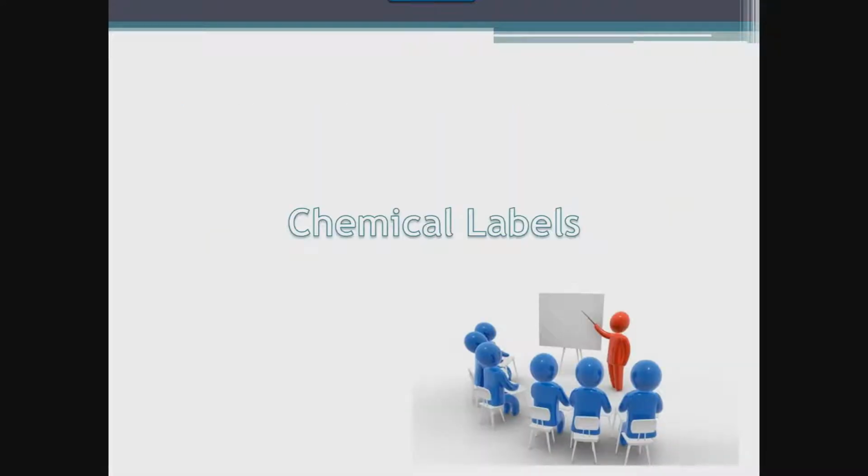So while safety data sheets are a great resource, it is important to understand the requirements of a chemical label, not only as a means to label a chemical bottle that needs labels applied, but also to know what information you can glean from the container of the chemical in which you are working, both of which are very important aspects of chemical safety. All chemicals must be clearly labeled with the chemical name and all hazard warnings as defined by OSHA. This includes all chemicals that are purchased and used out of their original container. In this case, it is important that the existing labels on these containers are not removed or defaced.